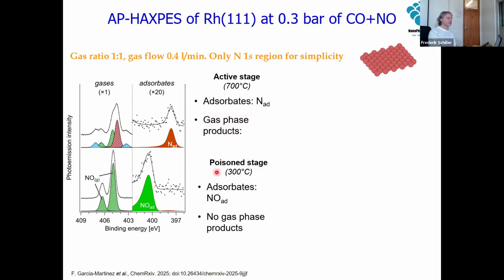Very quickly. So basically, at the poison stage, you see here now our temperature. You're not at room temperature anymore. It's already poisoned at 300 degrees centigrade. So we would heat this catalyzer to around 400-500 degrees centigrade in order to be able to do this reaction. So here we again have the nitrogen oxide sitting just on top of our sample.